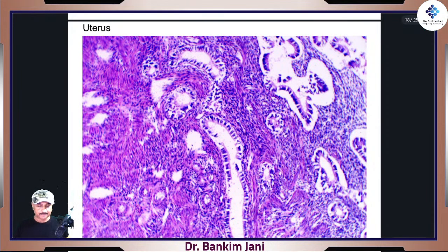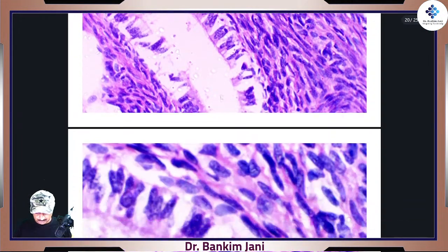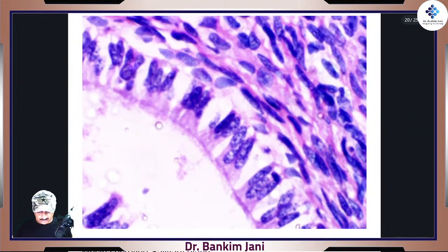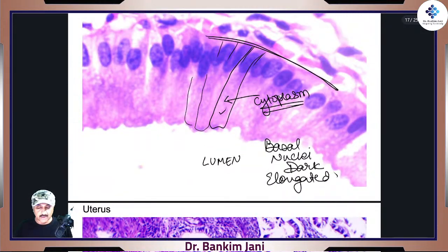That's uterus. Because in uterus there are lots and lots of muscles, what you are actually watching is lots of muscles. But then, into the cavity, as we zoom, as we cut, here it is. See these cells? Now, one reason that in uterus the cells are not appearing the way they were appearing in intestine.